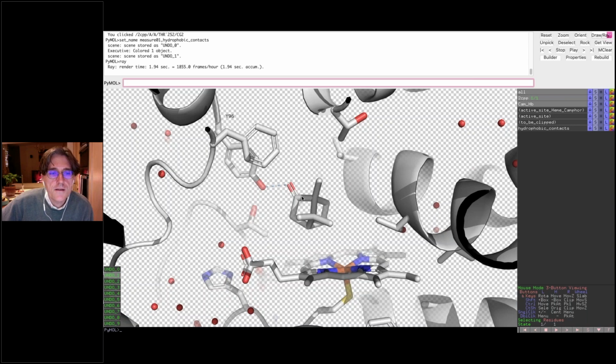But it also gets rid of aliasing. Aliasing is a computer graphics term that says that if I were to try and draw a diagonal line using pixels, it would go up step by step in a staircase effect. The way anti-aliasing works is it puts a gray value instead of a black or a white, and it blends into the background. The other thing you'll notice is that the background here has changed to a checkerboard pattern.